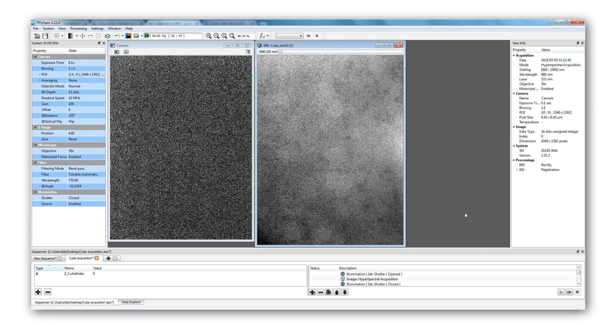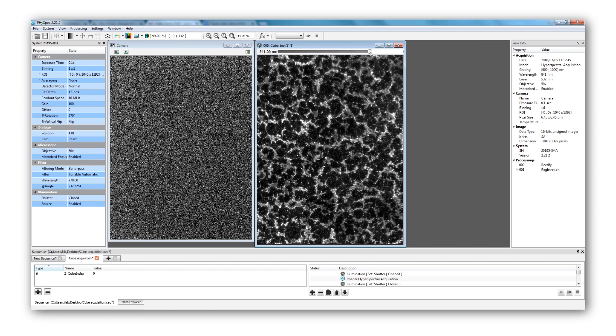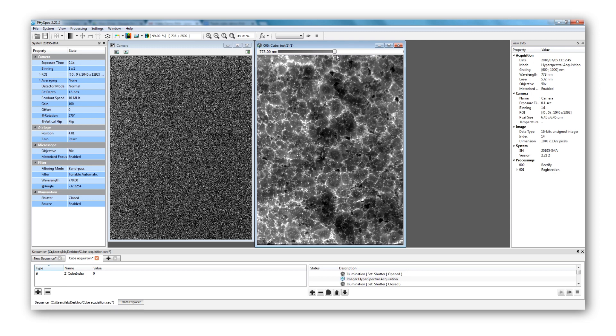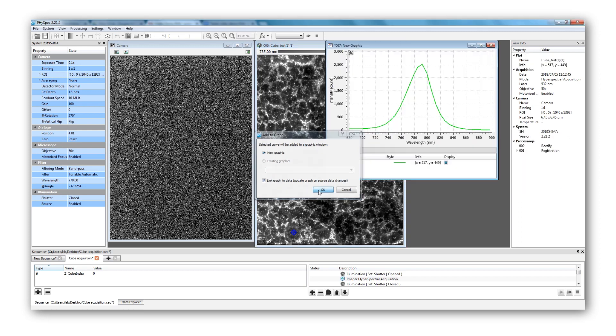Here is the final post-processed cube. We can go over each acquired wavelength by sliding the bar at the top. As we move along the wavelengths, we see different types of domains on the sample — a bright region means that photons are being emitted at the wavelength shown in the top bar. We will leave the image at around 785 nanometers, since we know that perovskite has its peak of emission around this wavelength. We will now place some targets on specific pixels. As a reminder, each pixel provides a photoluminescence spectrum, and since we are working with a megapixel sensor, we have just acquired a million spectra.